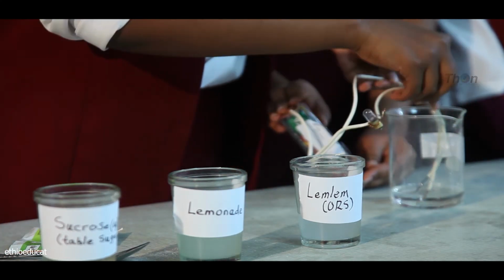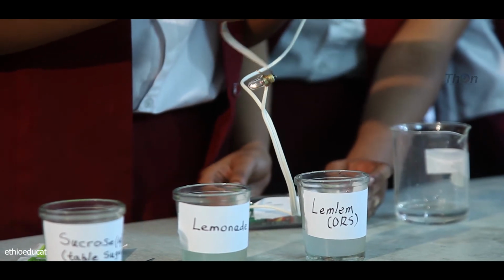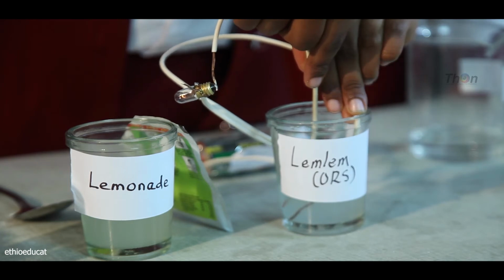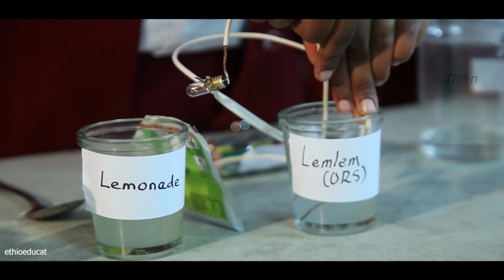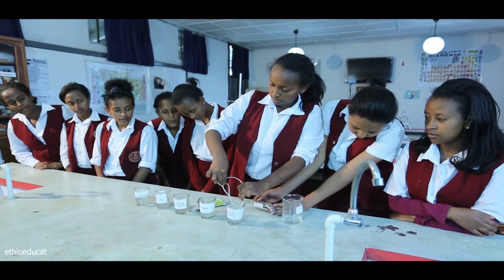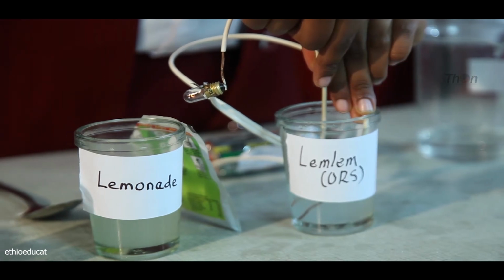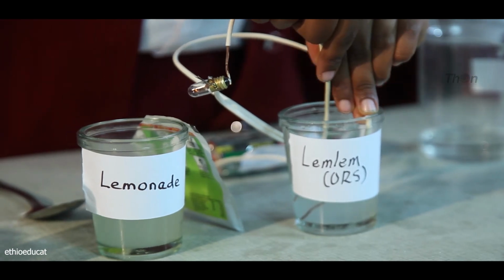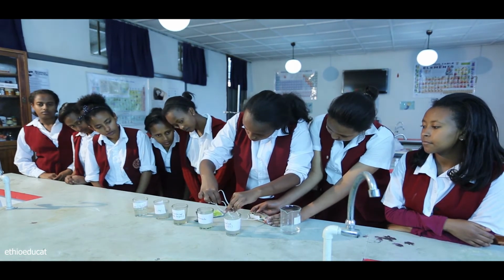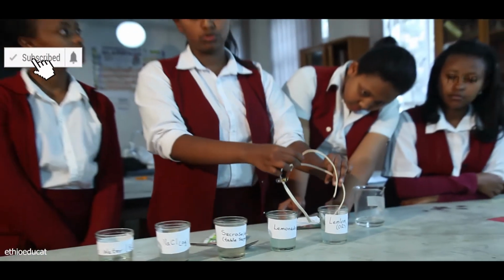So let's check whether the bulb is working. It's working. So let's check it in the ORS solution. Okay. Is it visible to all of you? Can you see this? Yes. No. Now they were touching each other, but without them touching. Okay. We're not seeing that much of a light. Yeah, slightly. But we had expected that it would be an electrolyte.